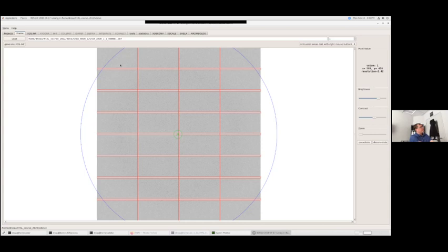There is a physical gap between those chips, but it's not as large as what you see visually when they present it. They just separate them out so that it's clear that they're individual tiles. And so then for the actual processing of the data, we just mask those off, and those red spots are showing that it's been masked off.